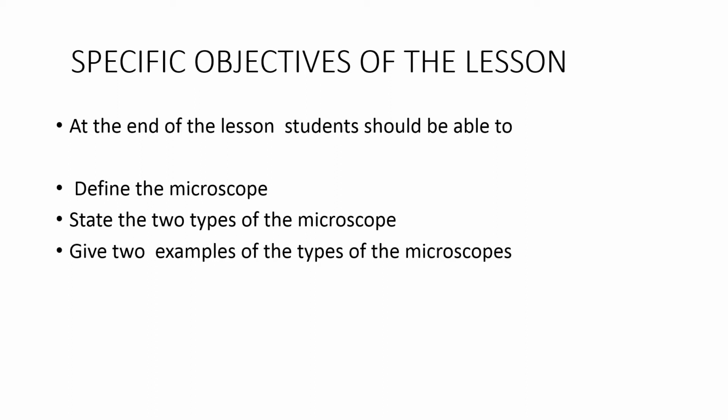So we should be able to define what a microscope is, state the two types of microscope, and then give examples of the type of microscopes that we have. So this is going to be the objectives for the lesson.